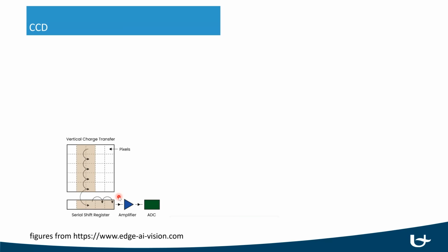Then, besides the question, how do we detect the electrons, there is also different technology in basically how to figure out where electrons landed on the detector. And traditionally, a charge-coupled device, or CCD, was the most common way. So basically, there is a picture about how this works here. So you have an array of pixels, and then you have something that looks a bit like a shift register. So let's say we create a charge here when an electron hits that pixel.